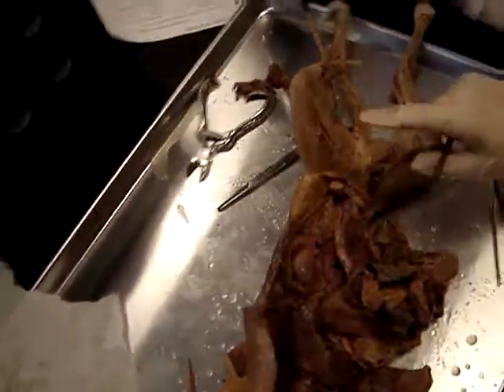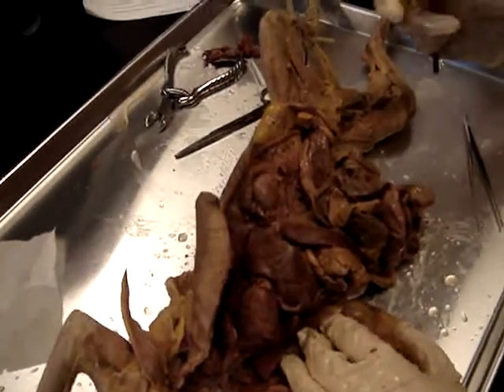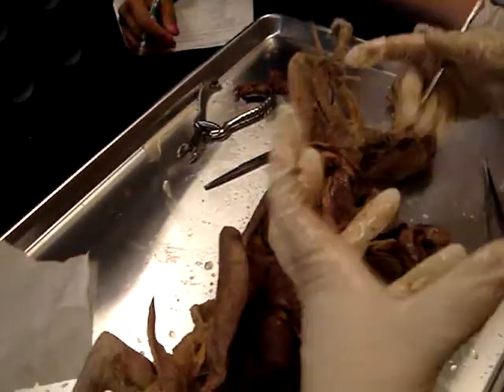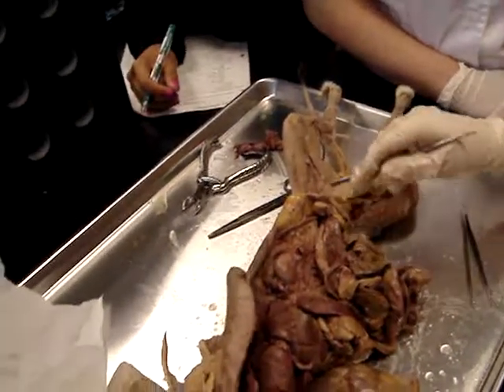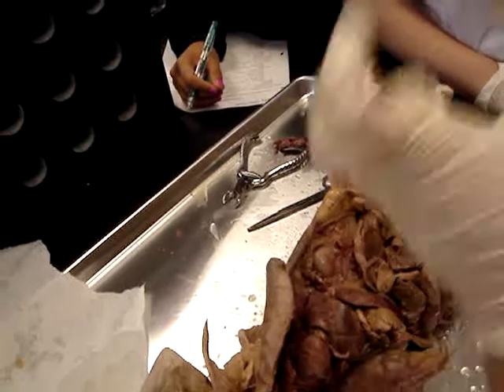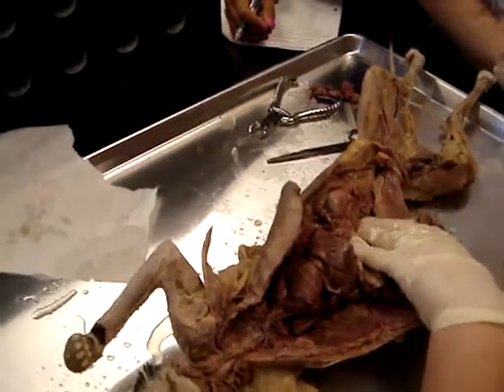Okay? Humans, we only have one baby usually. Sometimes we have more than that, but usually we just have one. So in humans, the uterus is like one big sac, a pear-shaped sac. But cats have lots of babies. And so they have their babies in two tubes. So their uterus is shaped like a Y. And so it has horns.